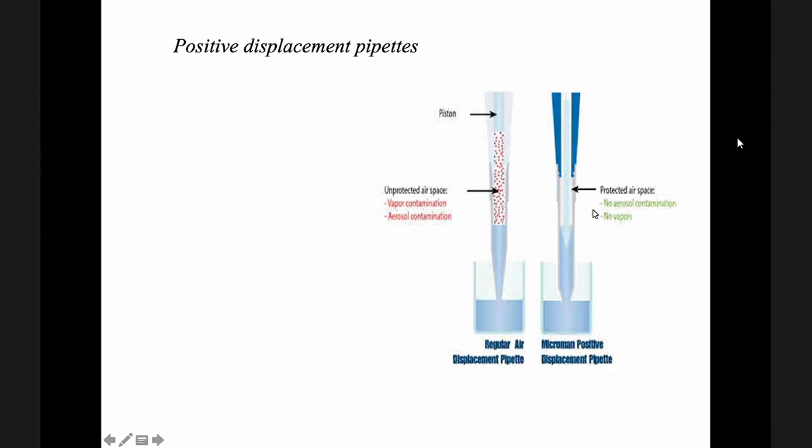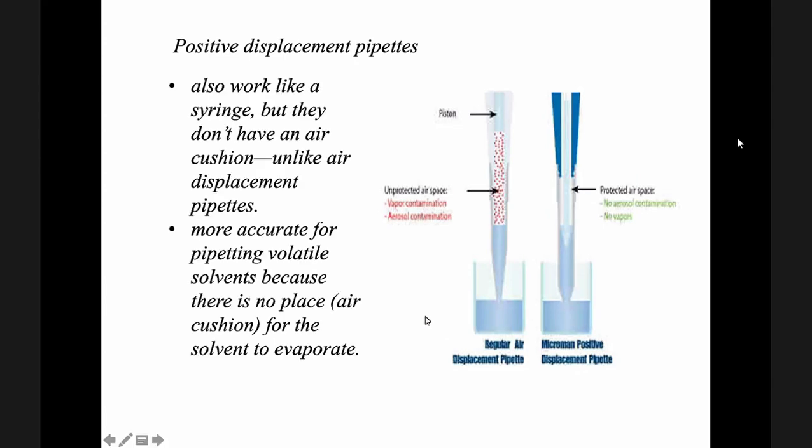So there is no aerosol contamination or vapor contamination. So the positive displacement pipette is better.